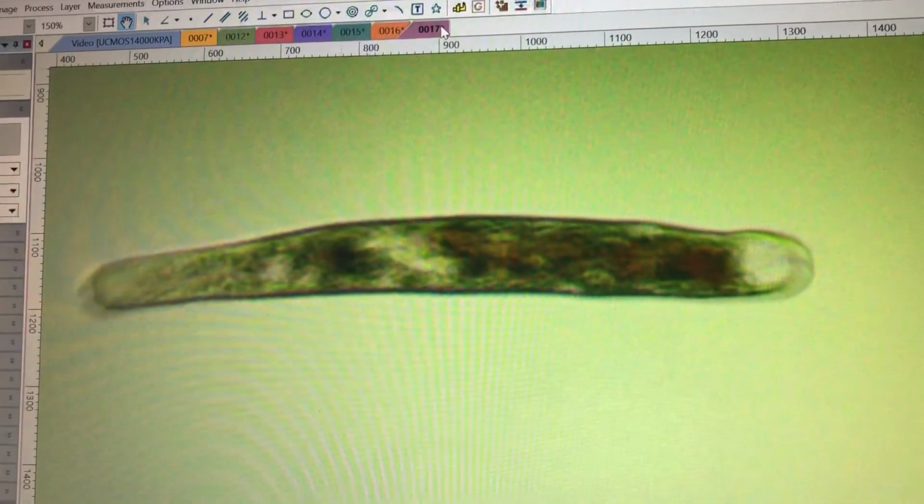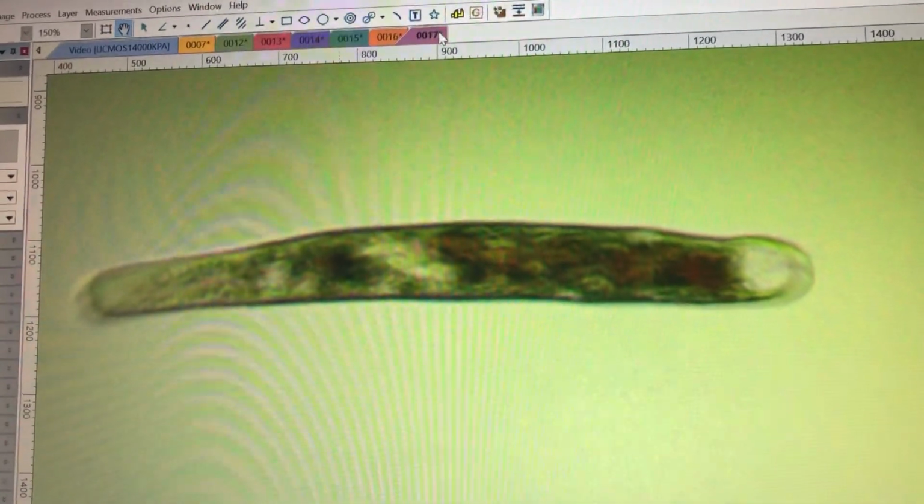Here's another picture of the Philaster. Again, these are the RTN parasites that cause coral RTN, or brown jelly, rapid tissue necrosis. And in my research, these are what I have shown consistently killing corals, and it doesn't matter what kind of coral, they kill all coral, and every dying coral with RTN, brown jelly, has this parasite in it.